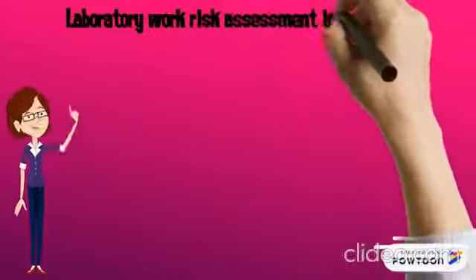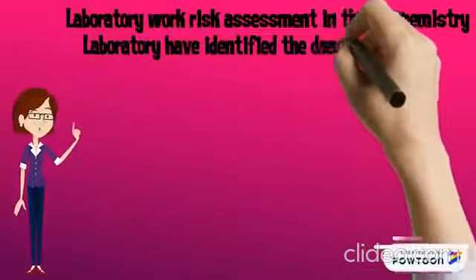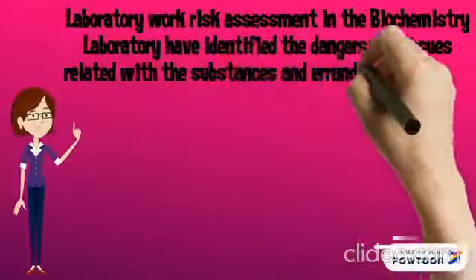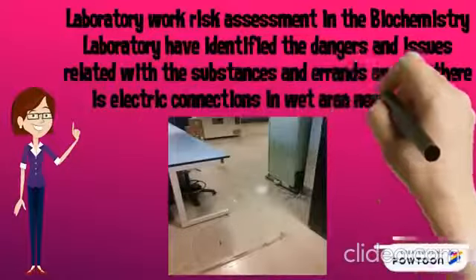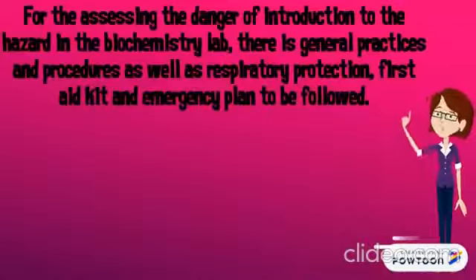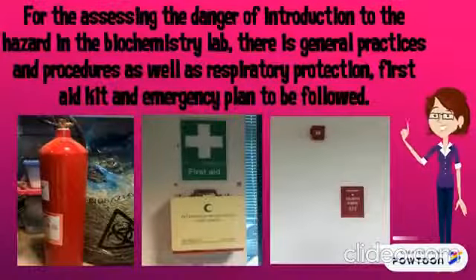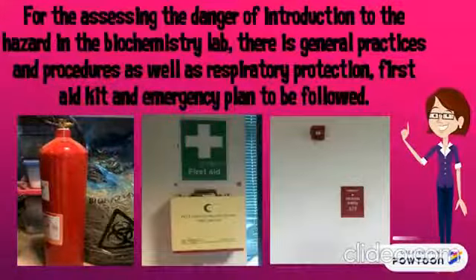Laboratory work risk assessment in the biochemistry laboratory has identified the dangers and issues related with the substance and tasks, such as the electric connection in wet area nearby the sink. Moreover, for assessing the dangers of exposure to the hazards in the biochemistry lab, there are general practices and procedures as well as respiratory protection, first aid kit and emergency plan to be followed.